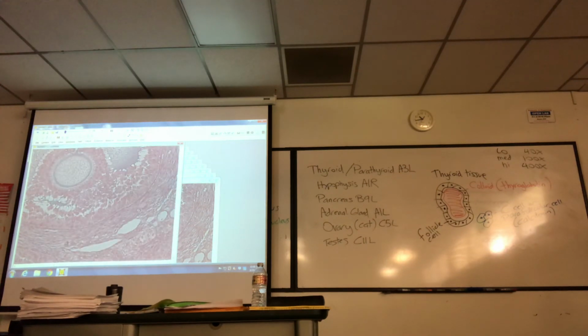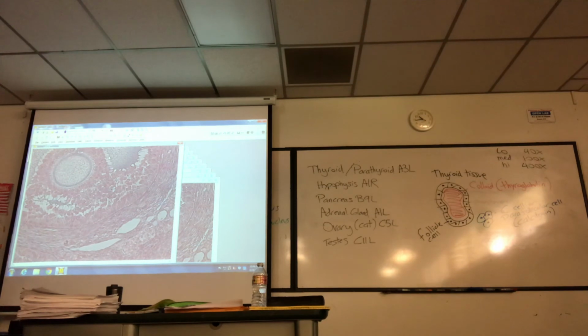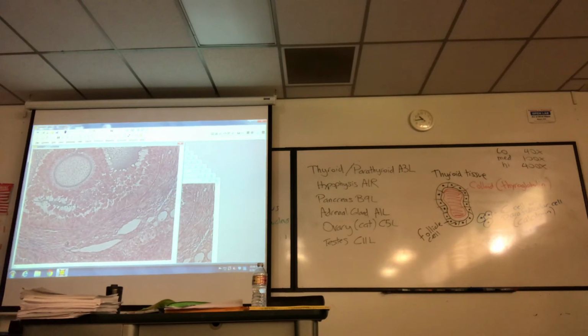We're looking at the oocyte inside a graafian follicle, right there. Here are granulosa cells, that's theca cells. These are the ones that secrete androstenedione, transferred to here, converted to estrone under aromatase activity. Okay, got that. One more slide, testes.